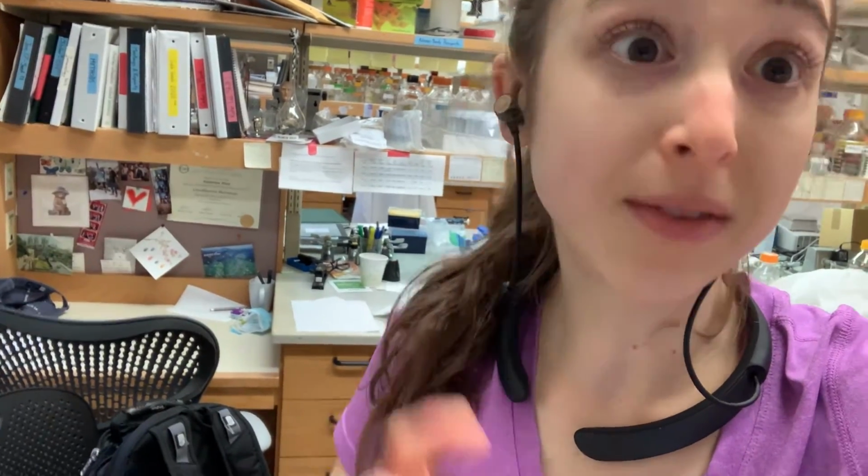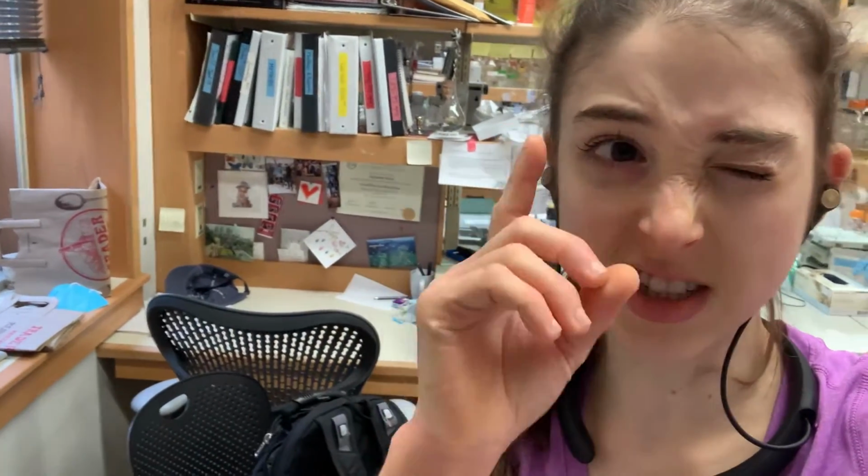Different molecules have different favorite wavelengths, and this is typically where we measure their concentration, based on the extinction coefficient for that wavelength in that molecule. But different molecules, even if that's not their favorite, might still absorb there to some extent. This can make it seem like we have more of our molecule, which is why it's important to look at different ratios to see how pure our sample actually is. So instead of just looking at that one favorite wavelength where we get the concentration from, we also want to look at a spectrum, how it's absorbing other wavelengths of light and not just that single one.